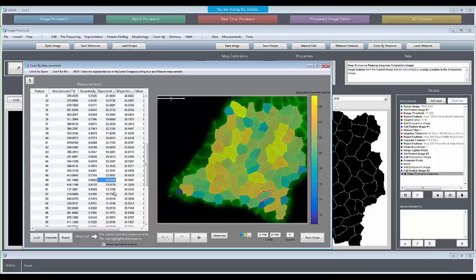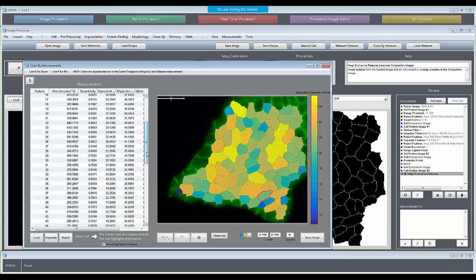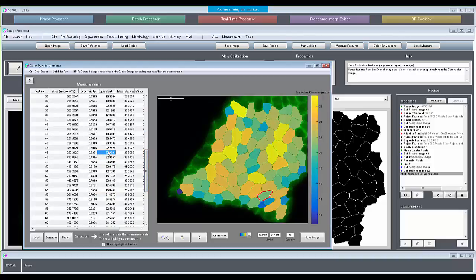However, we have had requests for printing the feature numbers on the actual features, either in this window or in the image processor window, and we're working on adding that. It might get into the next version where you'll have little boxes that show what each feature is labeled as. I prefer this kind of visualization because it not only lets you see what feature you're highlighting, but also lets you color according to measurements. But I definitely get that sometimes you want to hand your boss a spreadsheet of numbers and a labels map, so that you don't have to be in the software to make the connections.